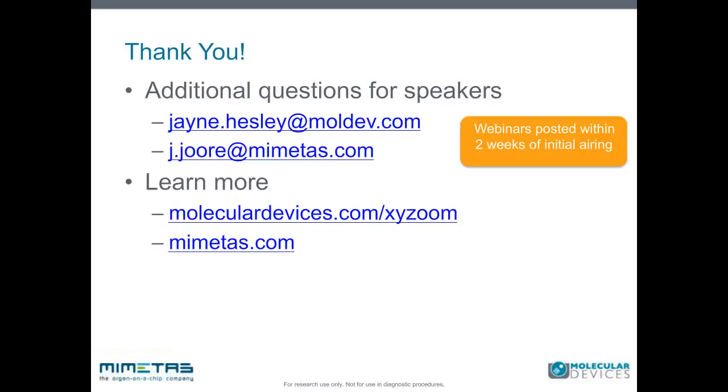Yes, we did, but we don't leave them that long inside the machine. The 5 days that you mentioned is obviously true. When we want to revisit cultures, we usually put them in the incubator and then put them back at regular intervals into the ImageXpress. And that allows us to do some really long-term assays.